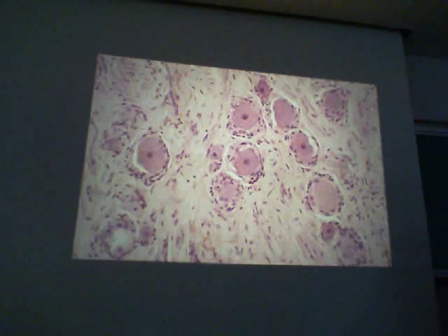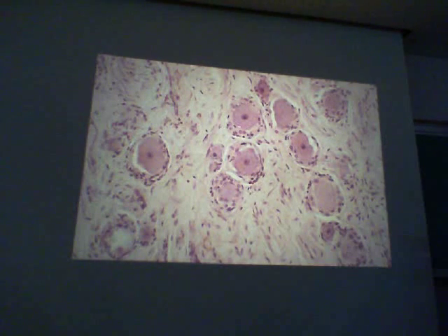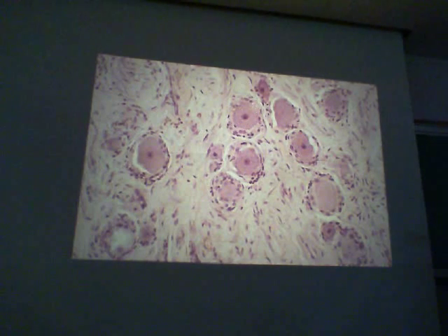How about that cell? What is that? Okay, that is a pseudo-unipolar neuron. We can't really see the stalk coming off of that, the one process. So we would probably accept neuron for that too, but hedge your bet and call it a pseudo-unipolar neuron. And the cells we find surrounding that are what? Satellite cells.